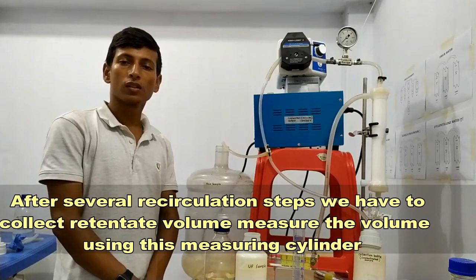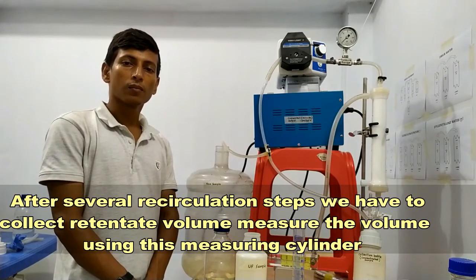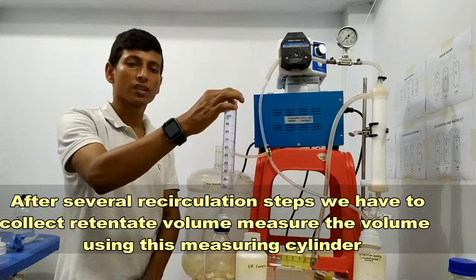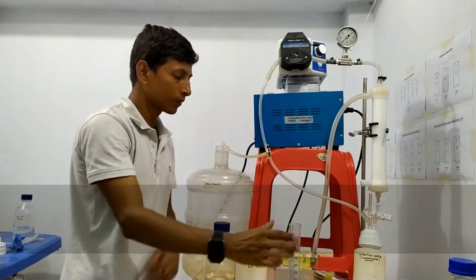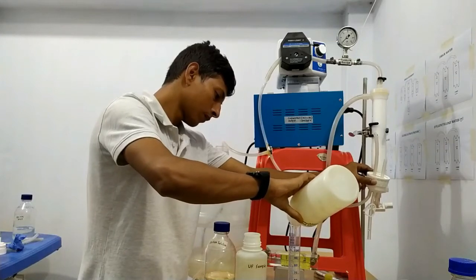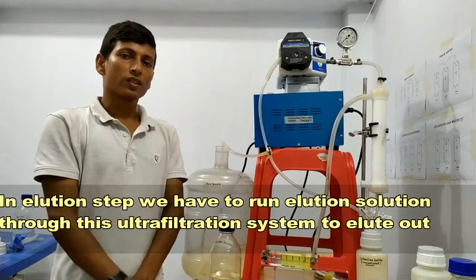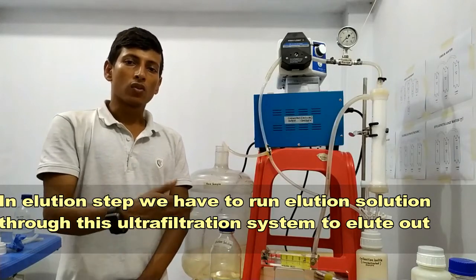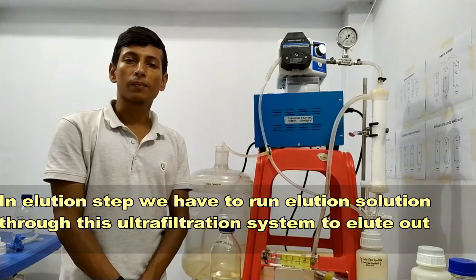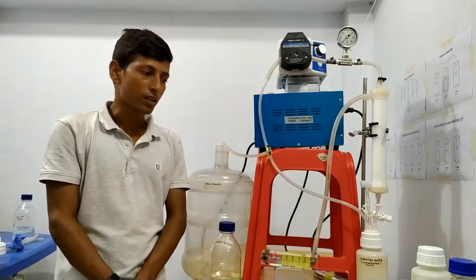After several recirculation steps, we have to collect the retentate water and measure the volume in the measuring cylinder. In the elution step, we have to run elution solution through this ultra filter system to elute out the retained pathogen from the ultra filter.